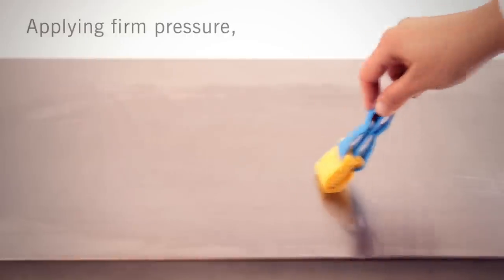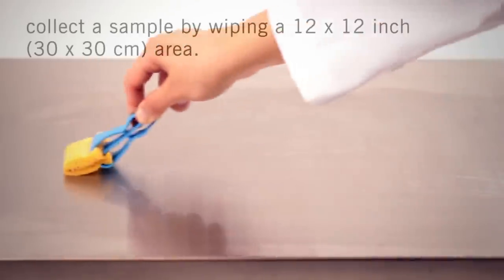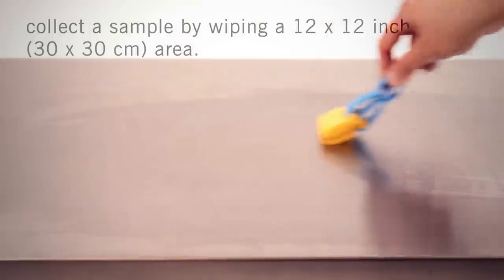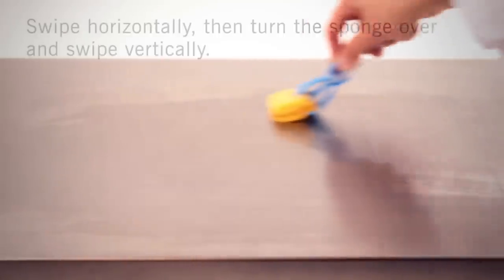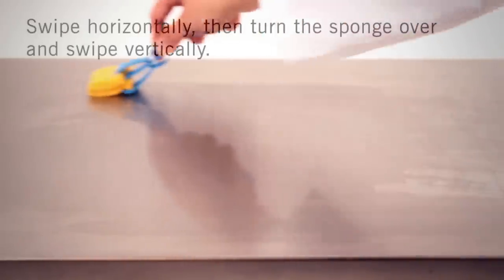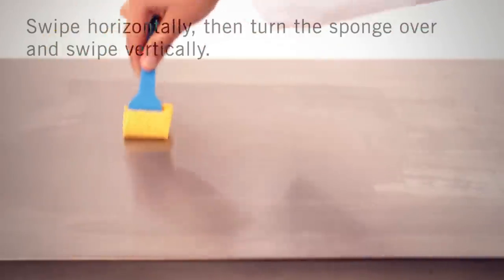Applying firm pressure, collect the sample by swiping a 12 by 12 inch area. Swipe the entire area of interest horizontally, then turn the sponge over and swipe the same area vertically.